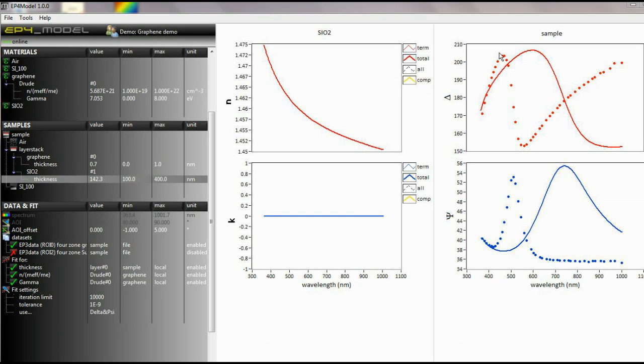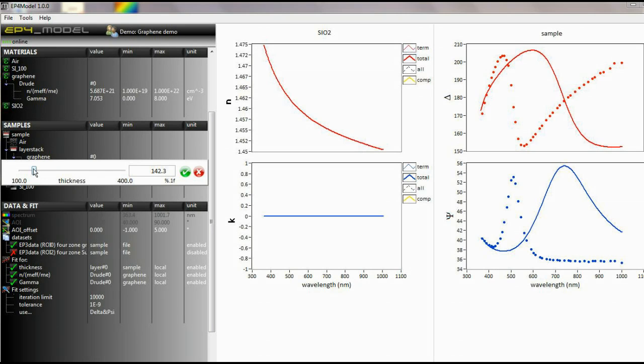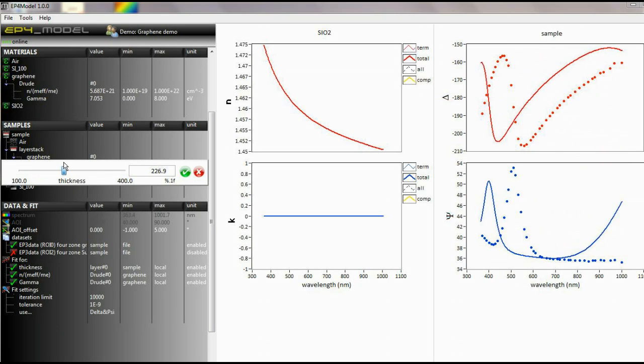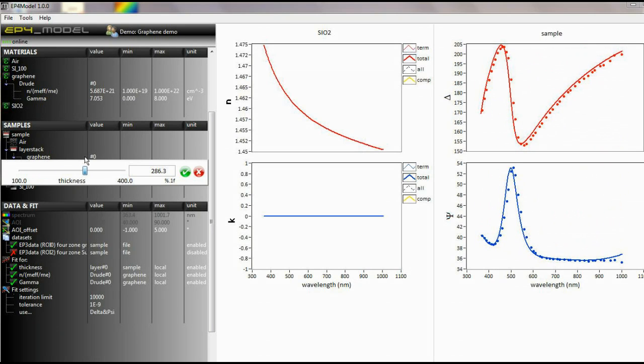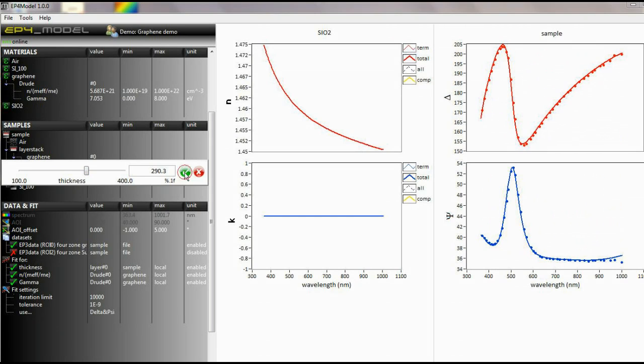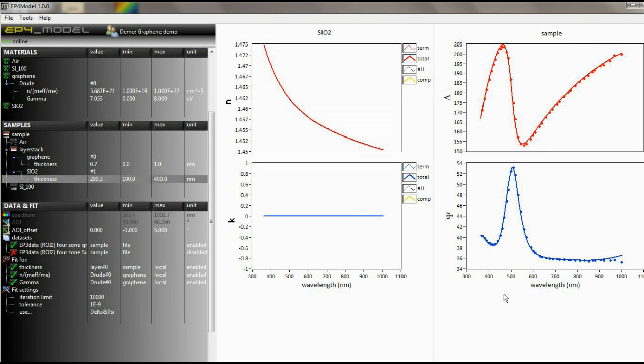As a layer is defined, the simulated delta and psi are displayed on the right side. You may change the parameters in the layer stack or material definition to see a change in the delta and psi functions in real time. This allows you to visually fit the material to your data without starting a fitting calculation.